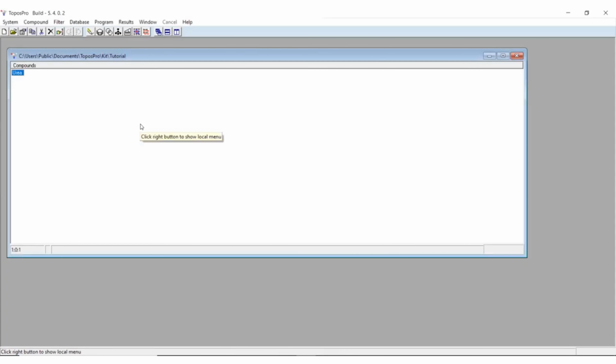In a previous video, I showed you how to calculate your adjacency matrix with AutoCN and then create a structure file for urea, and I also showed you how to remove the weaker interactions. But this video is going to focus on using AutoCN to create your own adjacency matrix. I'm going to go through it in a lot more detail, explain the different approaches you can use, and show how you can combine all these things together to get the adjacency matrix that you want.